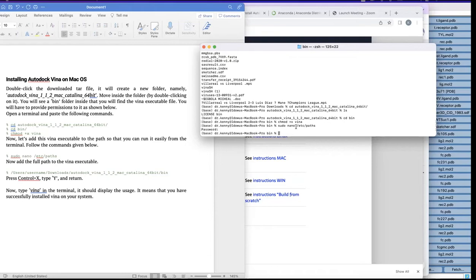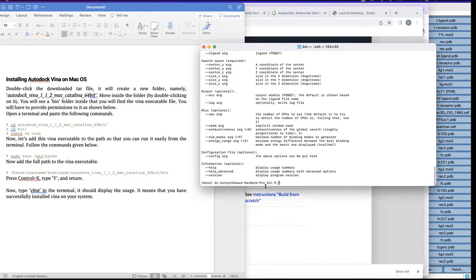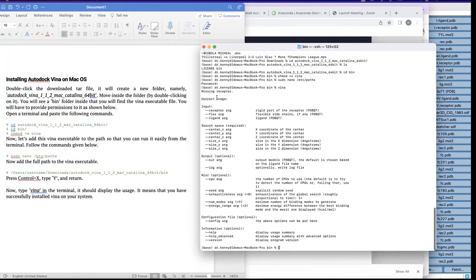You have now successfully installed Vina on your MacBook. To verify, just type 'vina' anywhere in the Terminal and press enter. It will give you correct usage information. When you see this, it means you have successfully installed AutoDock Vina on your laptop. If instead you get 'command not found,' that means you made a mistake somewhere in the process.